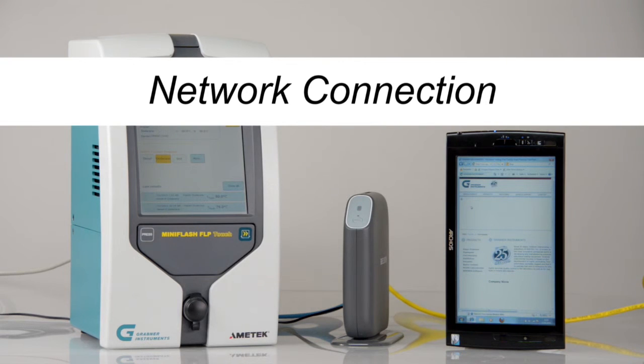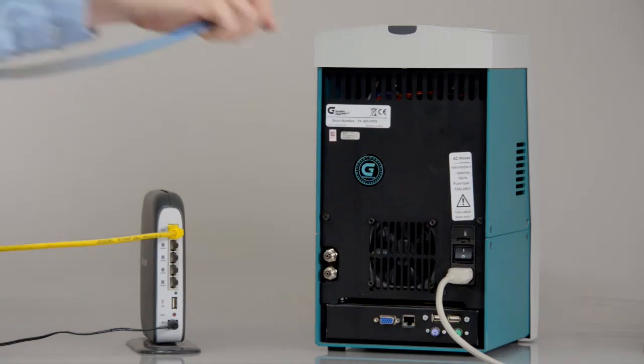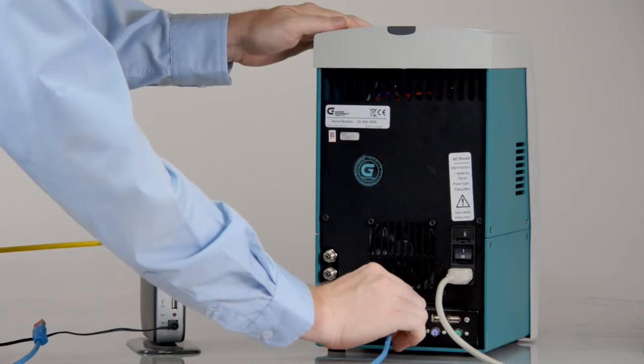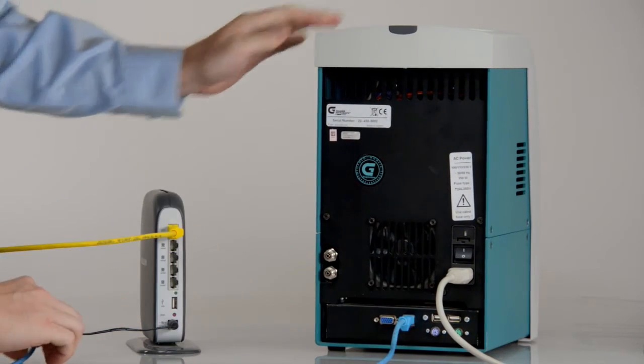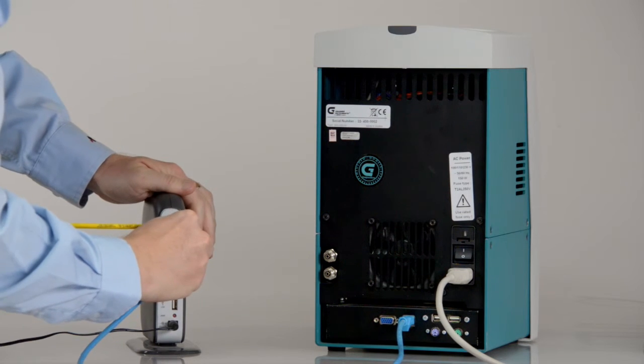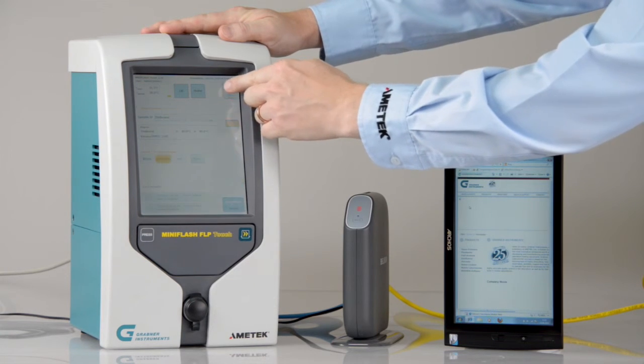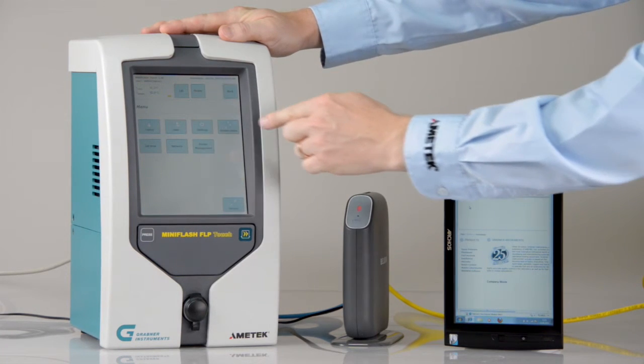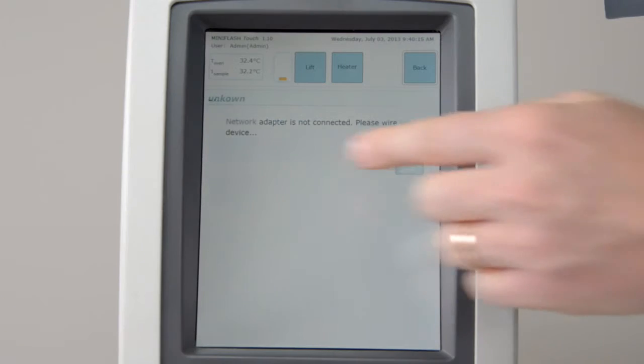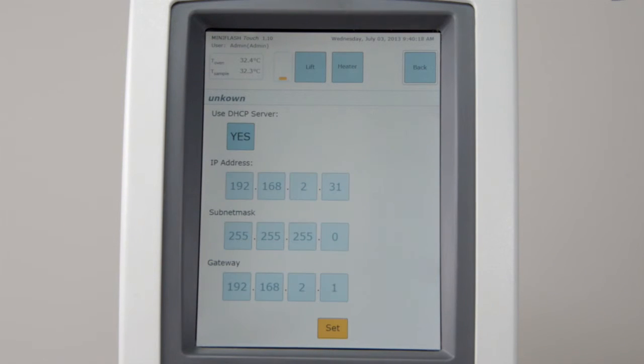Network connection. Administrator level users may configure a network. Use the patch cables to connect the FLP Touch to the router. Click on Menu, Network. Note the IP address. The instrument should be in DHCP mode.